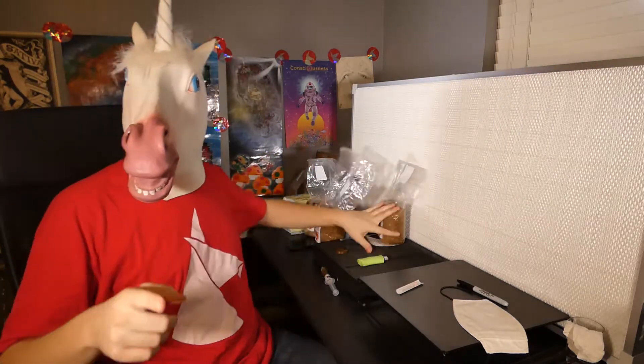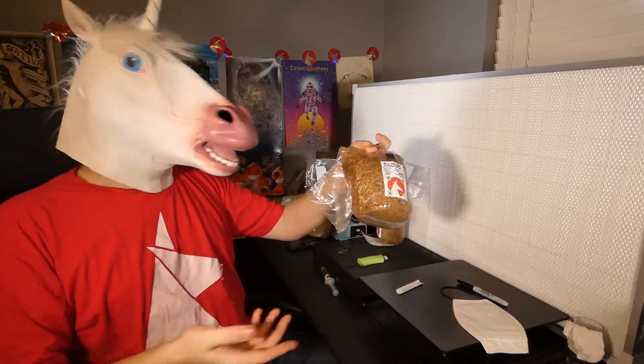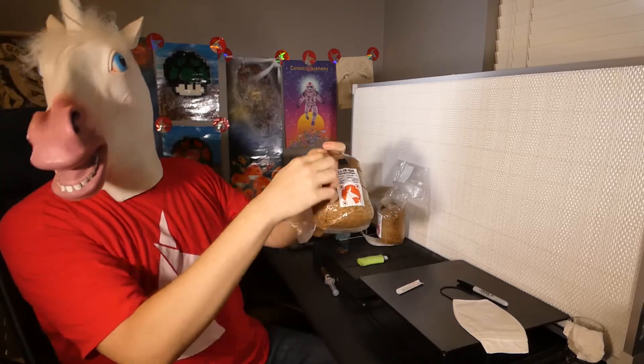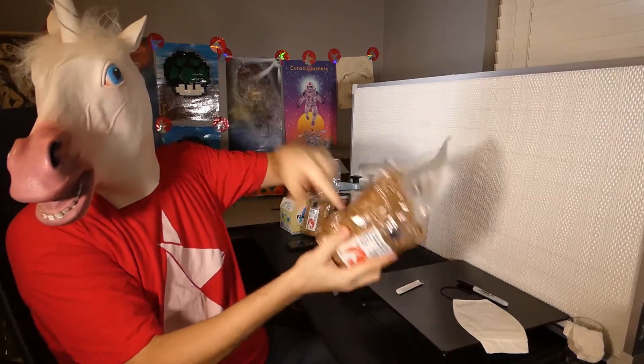Howdy, Unicorn here to show you how to inoculate a Unicorn bag. Today we're using a liquid culture syringe. Never trust a spore syringe to be sterile unless you know how it was made. It's always better to go from spore to agar, but that's another video. Let's get started.